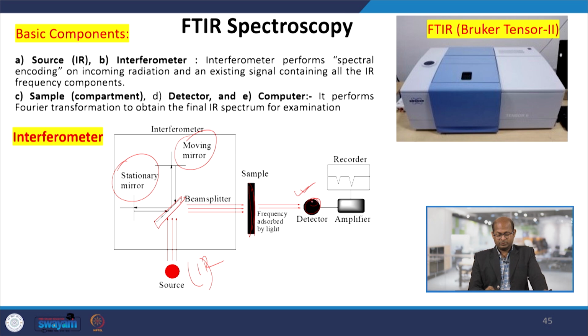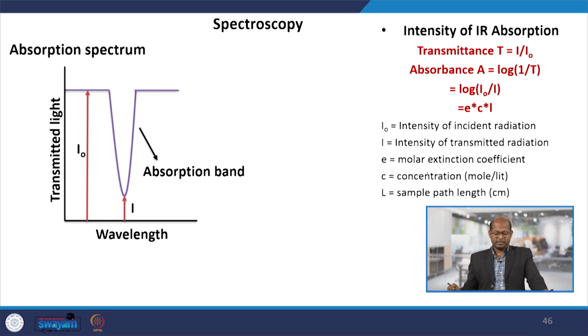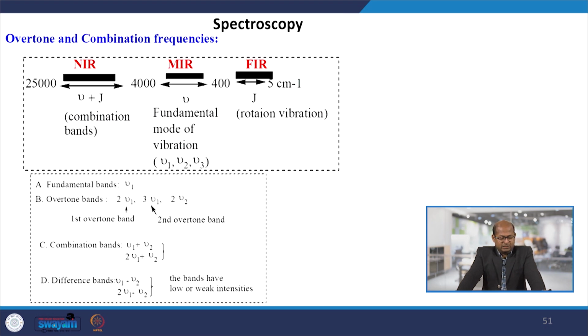So through that, in the recorder or computers, we can get a spectra: wave number in centimeter inverse, and intensity. So with the help of spectra, we are not going to discuss more details, so you can study it.